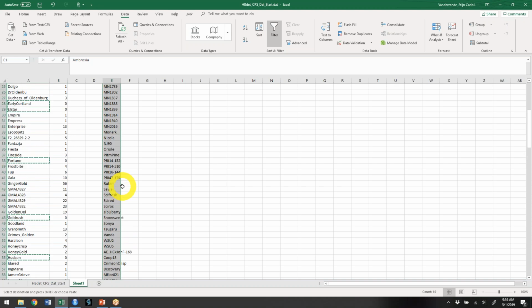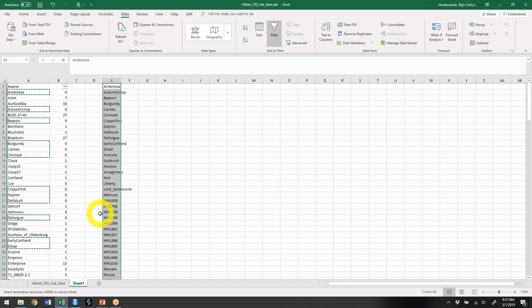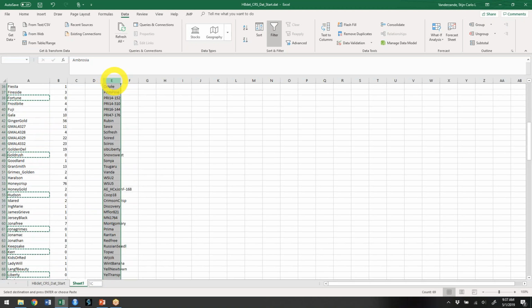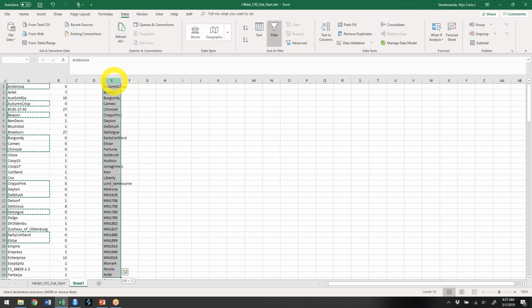The easiest way to make them have offspring in our data is to create some dummy offspring that doesn't really exist, that has these individuals as parents, so that these individuals get offspring in our data. In this case we have 69, so I need to split them. If I hold down Shift, I can start selecting individuals and count all the way down to 35.